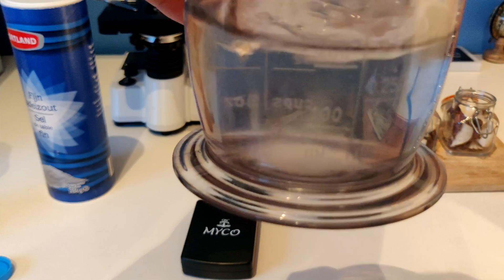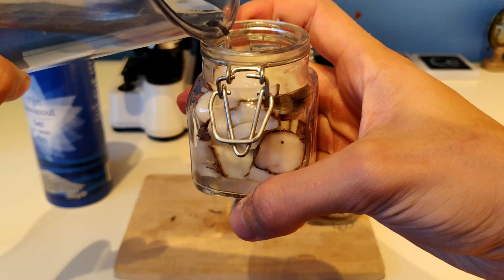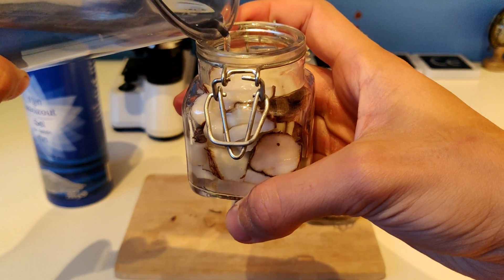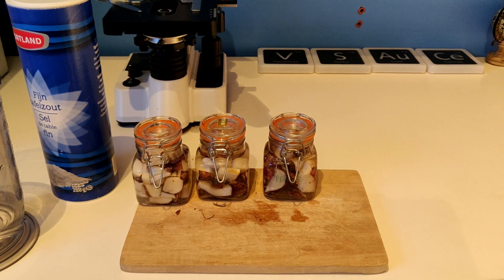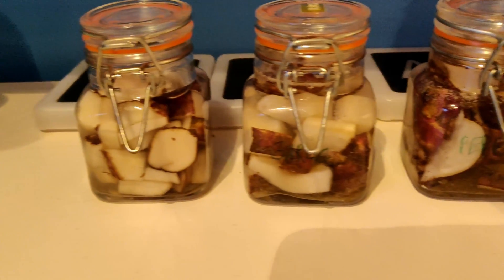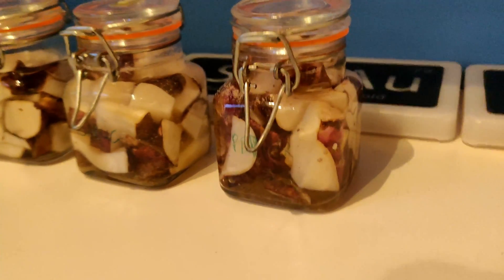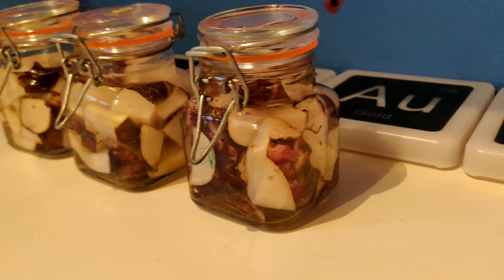After making sure the salt dissolved, you can pour the solution in the jars. I did this for 3 jars to make sure at least one would be successful. After closing the jars I put them aside for a few days so the fermentation process could take place.